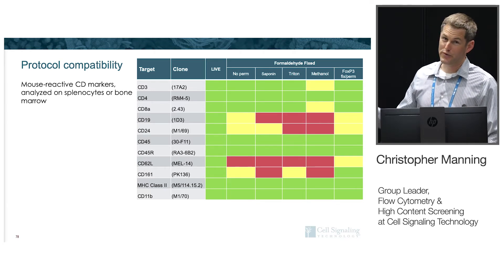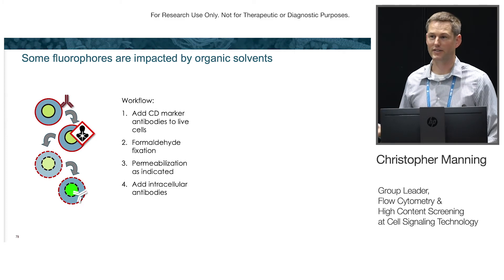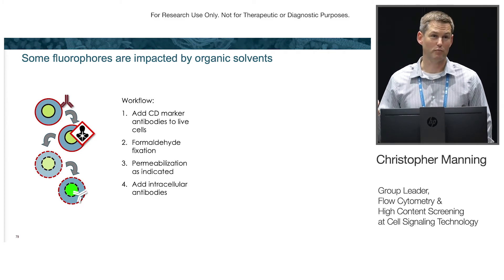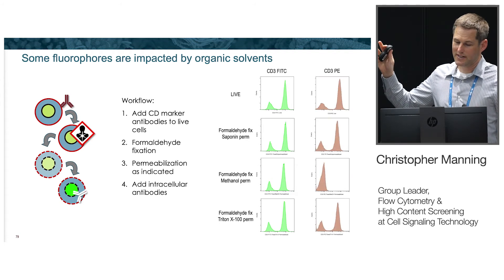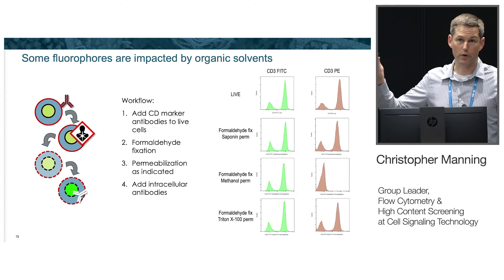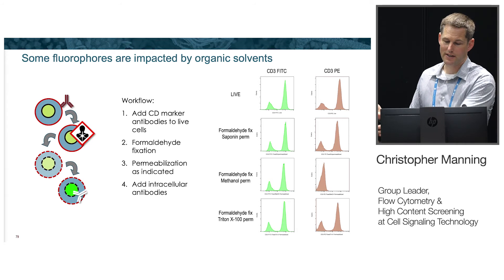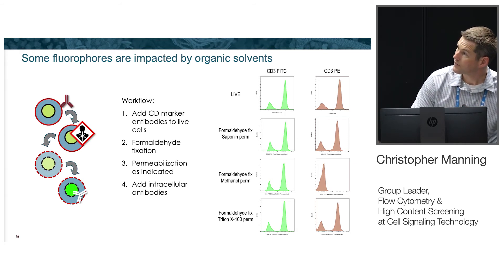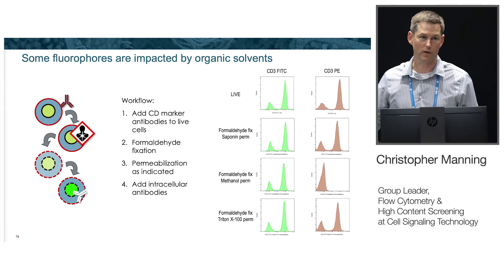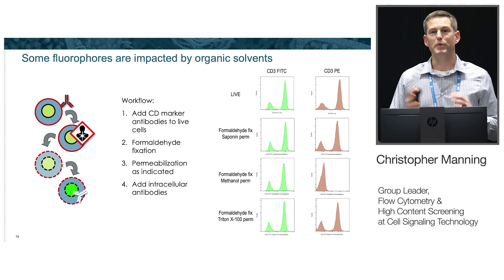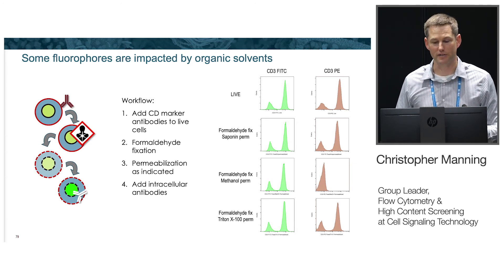One last point: if you add CD marker antibodies ahead of time, be aware that different fluorophores are sensitive to solvents. Methanol will denature protein-based fluorophores like PE and APC, causing loss of signal. For example, CD3-FITC and CD3-PE added to cells first, then fixed and permeabilized with methanol — you entirely lose signal with the PE fluorophore after methanol exposure. So if you add antibodies first and then permeabilize with a solvent, make sure you're not using fluorophores that will be destroyed in the process.